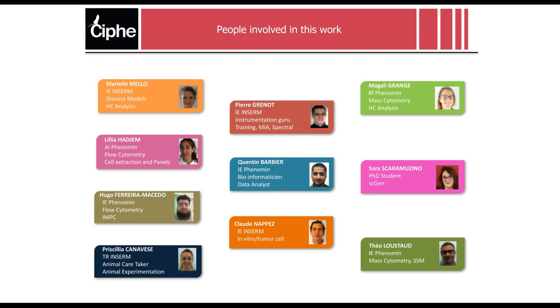Thank you, Dr. LUCHE. And our last question: for which type of cytometry do you use the Cytobank platform the most?